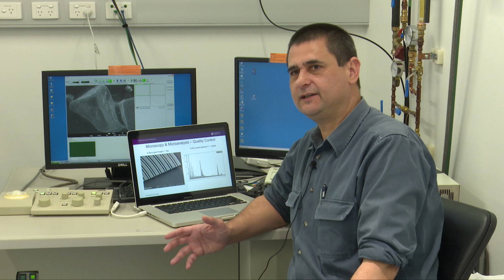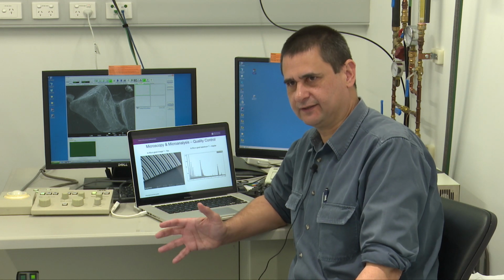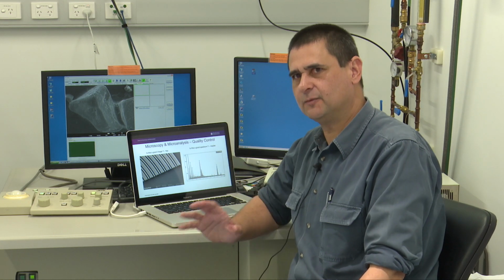Welcome everyone. This is the course on X-ray and microanalysis in the scanning electron microscope. It's the follow-on course from the SEM imaging course you should all have completed by now. Why do we need to do a separate course about microanalysis? I think that the critical point to understand here is quality control.